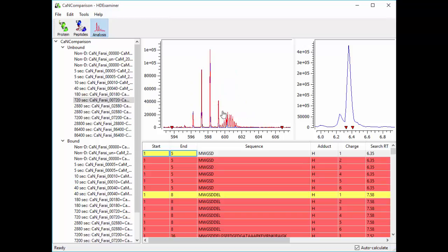It's only at an intensity around 20,000 or so. So that's pretty good. And in a number of cases, the medium calculation will do enough. But every once in a while, you'll get some tough nut to crack that requires more. And in that case, you should use the complete algorithm.